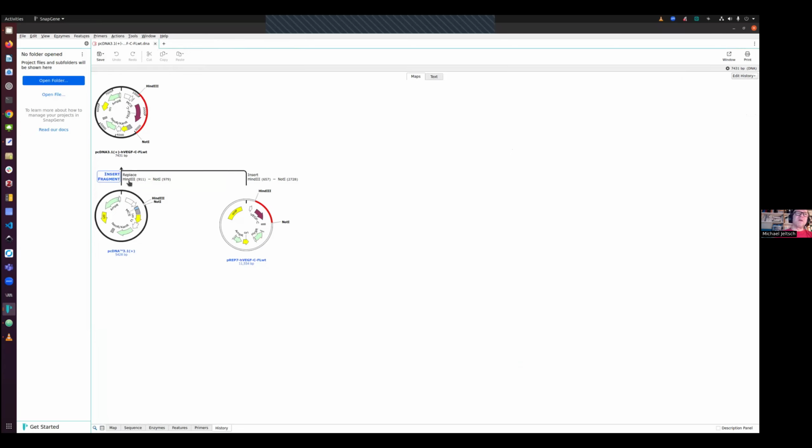So if you have 2 files, that means you have been doing something wrong. The same, of course, if you have one file, but you don't have a history, then you have also done something wrong, because other people are not able to replicate what you have been doing if you don't have the history. You can actually manually delete the history, but you should never really do so.